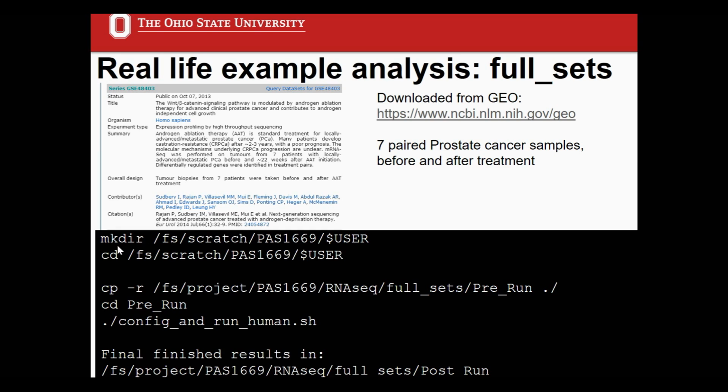Then you can make a directory in the Scratch folder. Please pay attention here: it's not a project folder. Our project folder doesn't have such a large space. So you have to create your own folder under the Scratch folder, under the PAS 1669 project folder, but within the Scratch space.